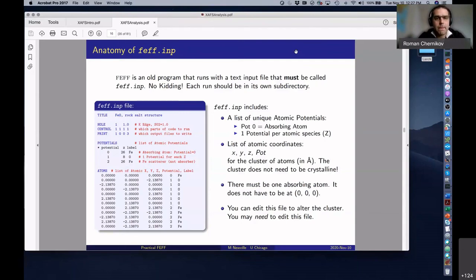I agree. If that's an effect of the monochromator calibration changing between two scans, then yeah, the E0 will be different. You may want to align the scans, and I will argue, or at least hope, that you and whatever beamline that is will try to fix the problem, because that's a problem that should be fixed. I recognize that it's not always fixable, or that it's not easy or cheap to fix, but it might be fixable. It's better to have as reproducible as possible.